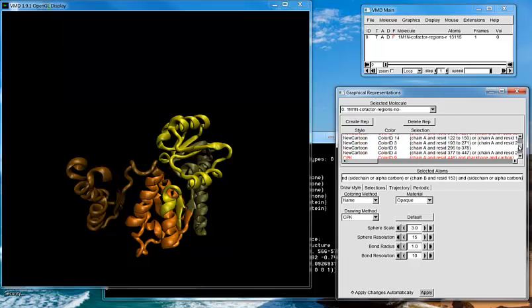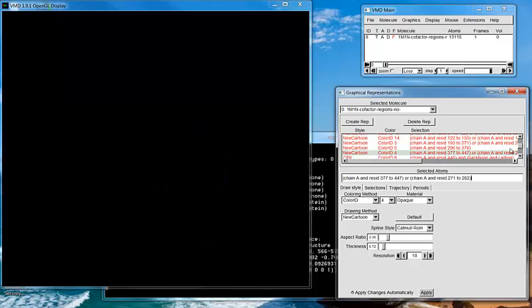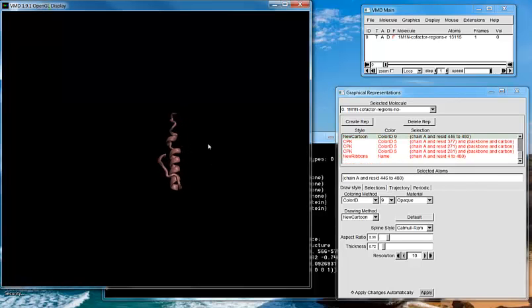So that I can just break this up into something simpler to work with. Now, one of the ways I broke this one up was just starting from the beginning. You can see this is actually going backwards. This is going from residues 480 through 446, and this would be one of my components. And I could print this.